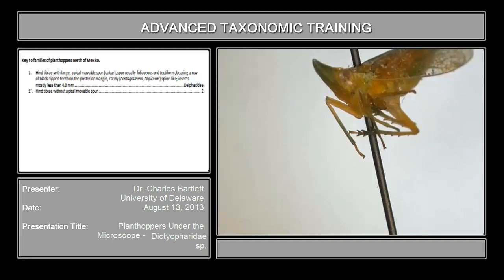I'm Charles Bartlett from the University of Delaware. I have two specimens I'd like to look at fairly quickly, then we'll be done with the family level keying.